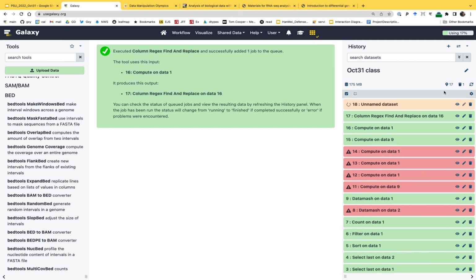Yes. In the case of RNA-seq, there must be databases where different gene names used for the same gene are mapped. You would think, yes, but no. Well, maybe, but there must be some kind of tool where you can homogenize the data. No? Do you know such a tool? No, I don't know.